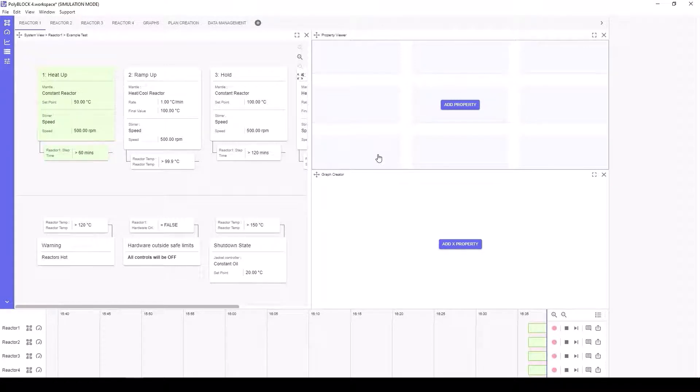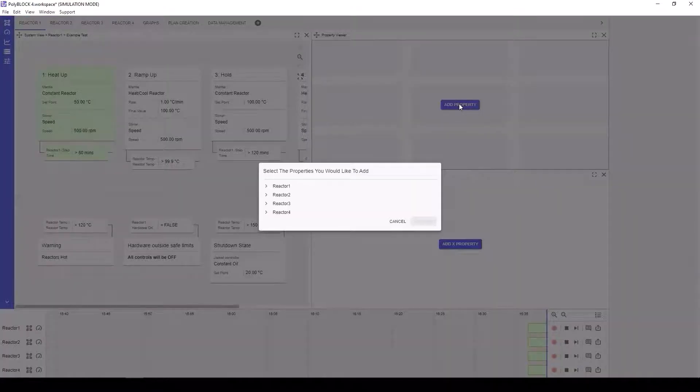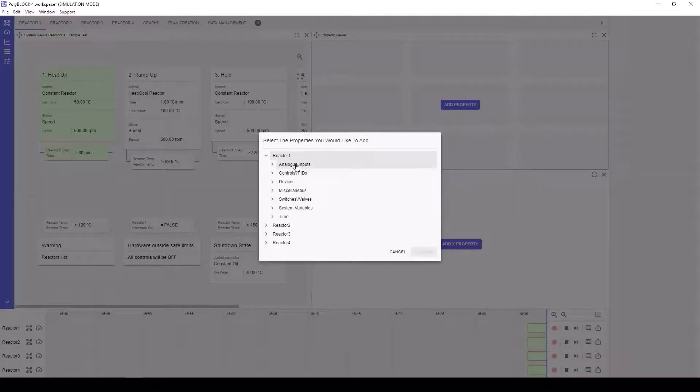To add parameters to the Property Viewer, simply select Add Property. This will bring up a list of parameters. You'll notice that it is possible to add properties from different reactors into the same Property Viewer.